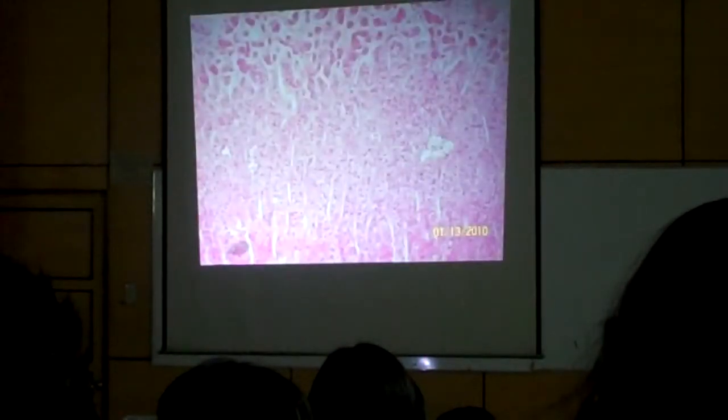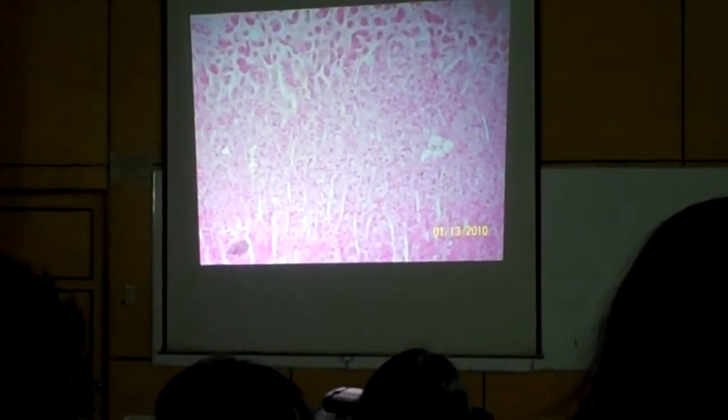suprarenal vein. Okay. The medulla is bluish, more bluish in color than the cortex. And if we will, again, try to focus it, you will have a view comparing all of the layers. It's hard to identify just when you focus just on this area, for example.